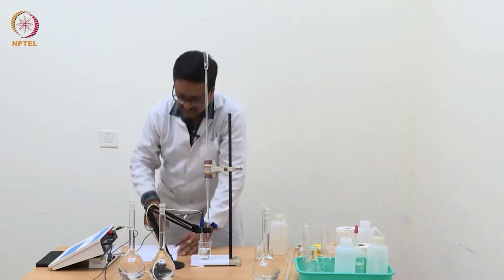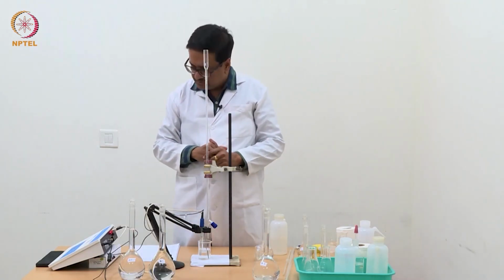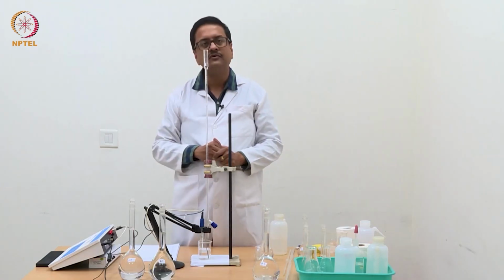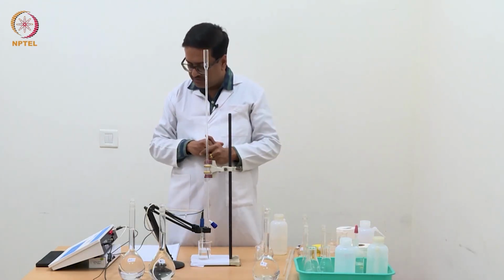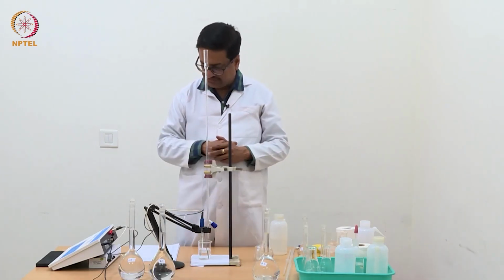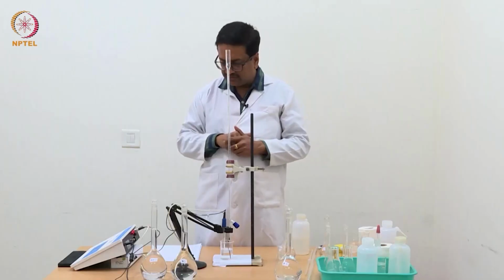So what we see over the last four readings is that the readings are 10.21, 10.32, 10.40 and 10.47 over a range from 1.54 to 1.64 ml of NaOH, that is over a range of 0.1 ml of addition. This indicates that we have reached a plateau for the pH curve towards the high end of pH.